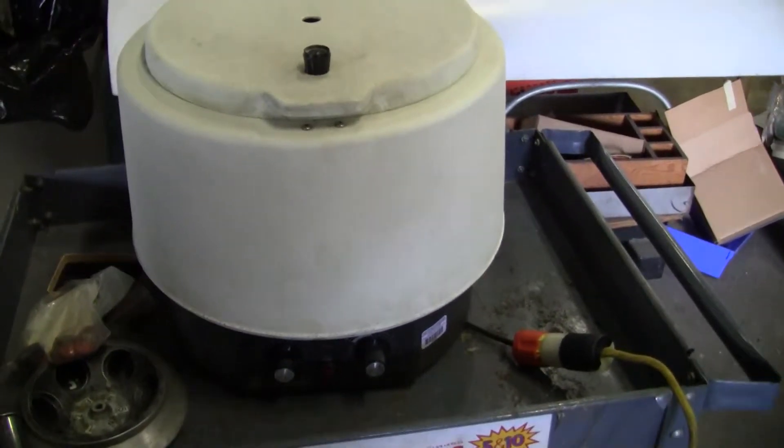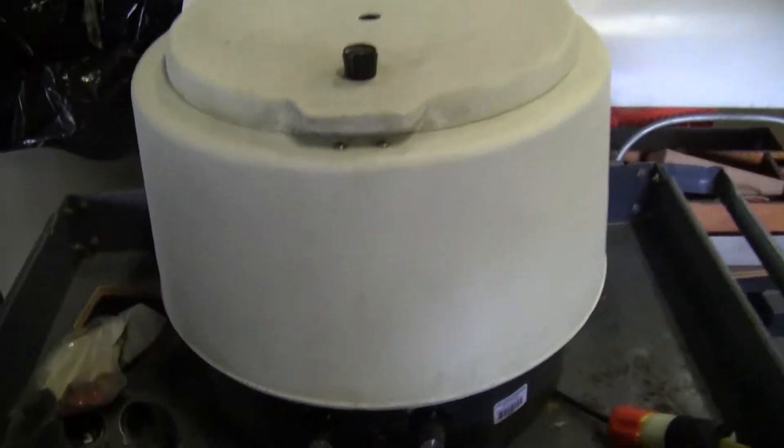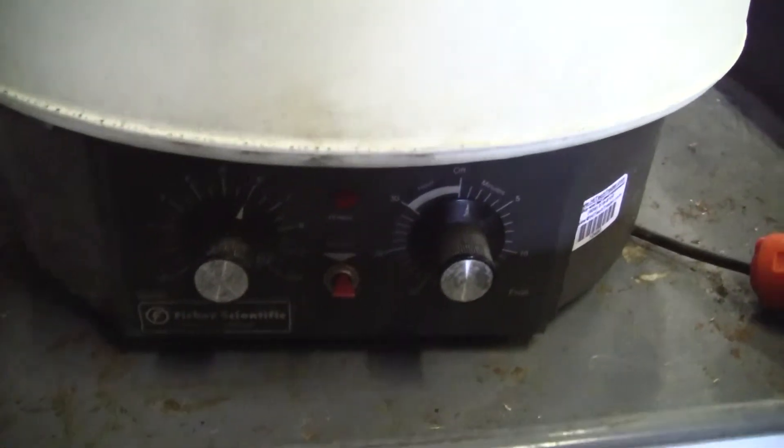Hi, this is Michael from HitechTrader. Today we're looking at a centrifuge — this is a Fisher Scientific Clinical Centrifuge.